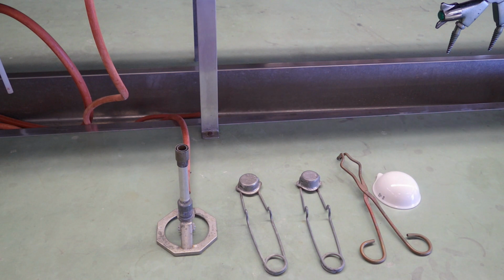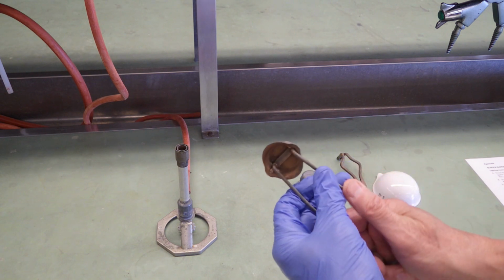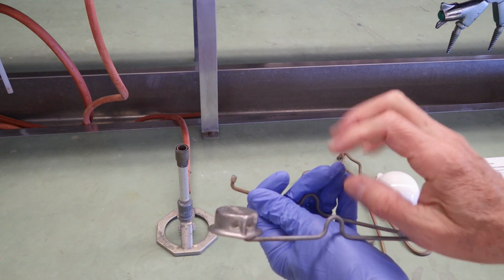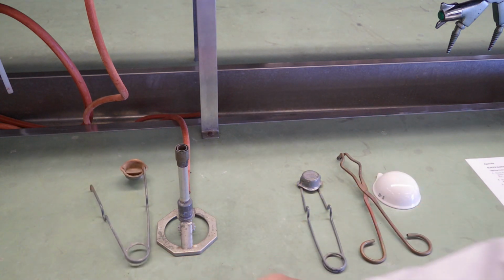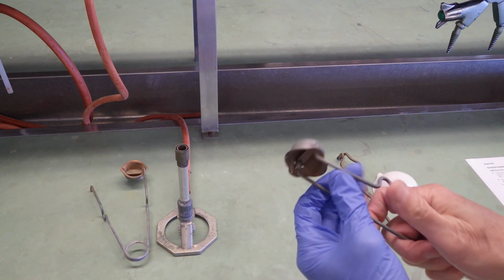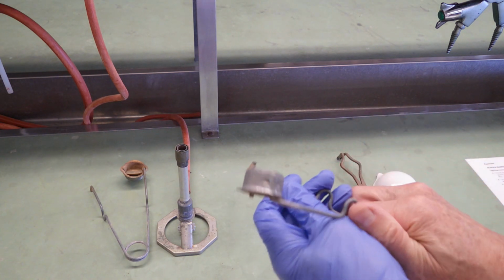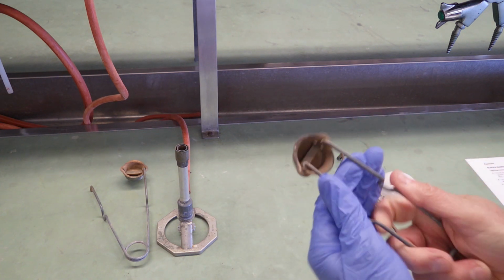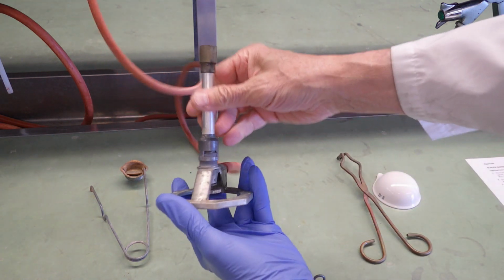This seems like a good time to show you how to light a Bunsen burner. First you want to check that the igniter can spark. Not much there. Open it up, look, there's not much flint left here, barely anything exposed. Let's try another one. Right, so there's flint, so that should light. You want to scrape that flint pretty hard against the back rough surface to get a spark.